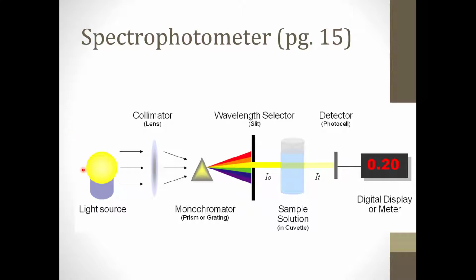So a spectrophotometer is a device that has a light source and then perhaps a prism or different color light bulbs. So it shines light of different wavelengths through the sample and then detects which wavelengths pass through and which wavelengths are absorbed. And just so you know, like in this example, the beta-cyanin would be in this cuvette right here. A cuvette is the fancy word for the container that holds the sample in a spectrophotometer.